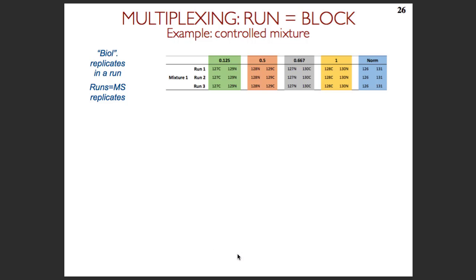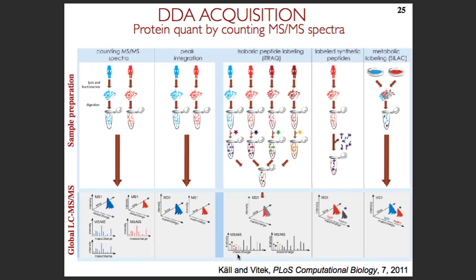Now, so this is really a difficulty on the experiment, on the data acquisition side. And there's another difficulty which relates now to the experimental design. The fact that in label-free LCMS we have one run per sample makes things very easy in a way, because we have a sample, we acquire the data from it, right?